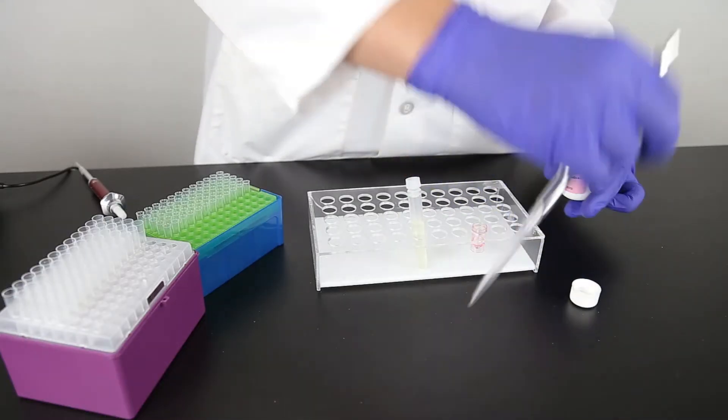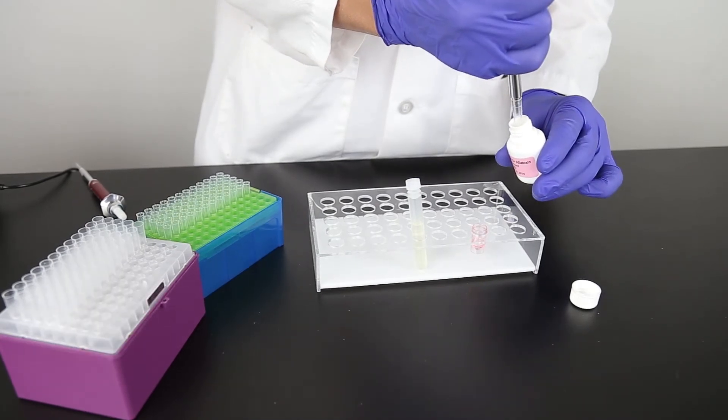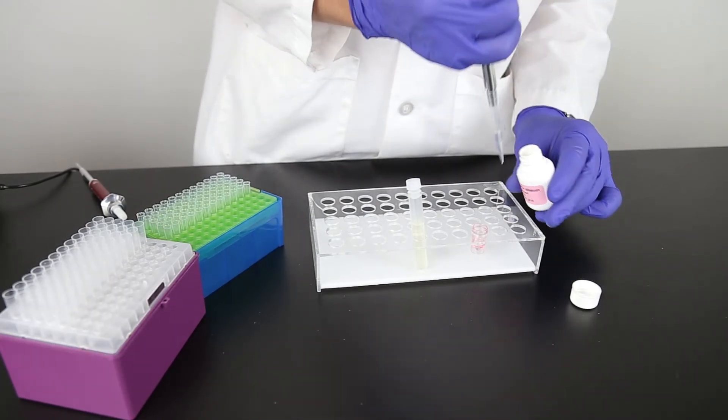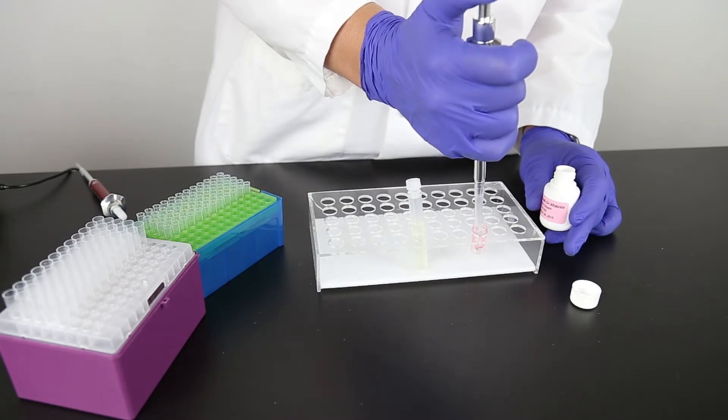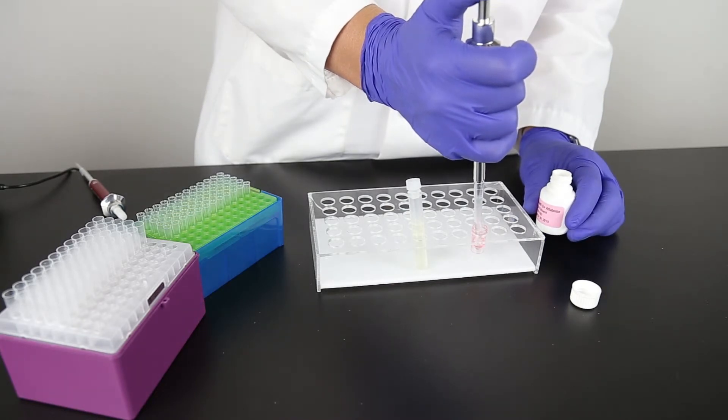Next, add 500 microliters sample diluent to the sample cup. Mix by pipetting up and down five times. It is important to mix thoroughly.